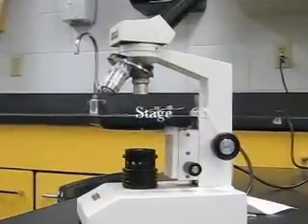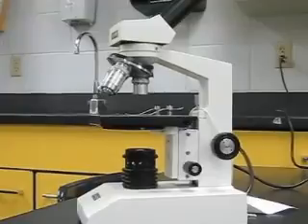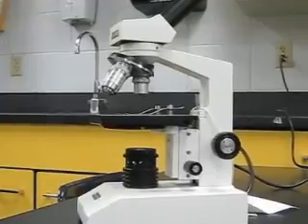The microscope stage is found in the middle of the microscope. This is the location where you're going to put your microscope slide for viewing.